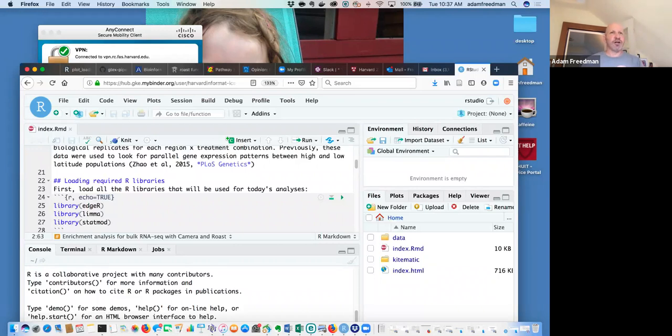And these tools are complementary. They both are designed to account for the correlation structure in expression when they're calculating p-values. They do it through different methods. CAMERA estimates the correlation between expression and then makes adjustments for it. Whereas ROAST uses a rotation method, a derivative of Monte Carlo based methods, which I'm not going to get into the details of, but needless to say, they both do what you're supposed to be doing for RNA-seq data.